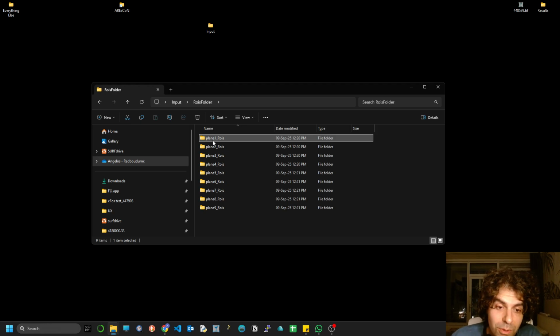I've used both, they're both good, I have to say. I would prefer, to be honest, Cellpose for cell detection. For the nuclei, again, I would say that in my case, Cellpose worked better, but that might just have to do with the nature of my samples, and by no means do I want to underestimate the capabilities of Stardist as well. So, having described that, let's have a look first.